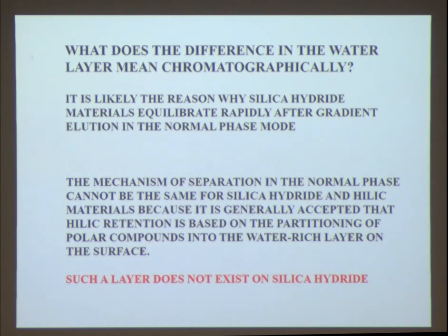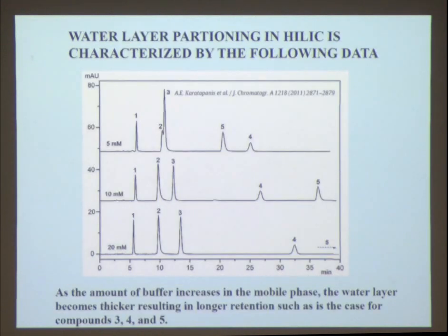They've been talking about it and trying to understand why the HILIC material, the ordinary silica, takes so long to equilibrate. All right, so we have to begin to think, well, there has to be a fundamental difference between how silica hydride retains compounds versus how ordinary silica retains compounds.